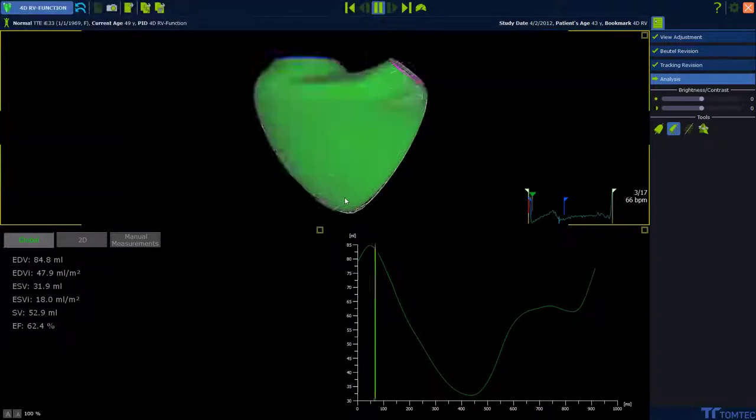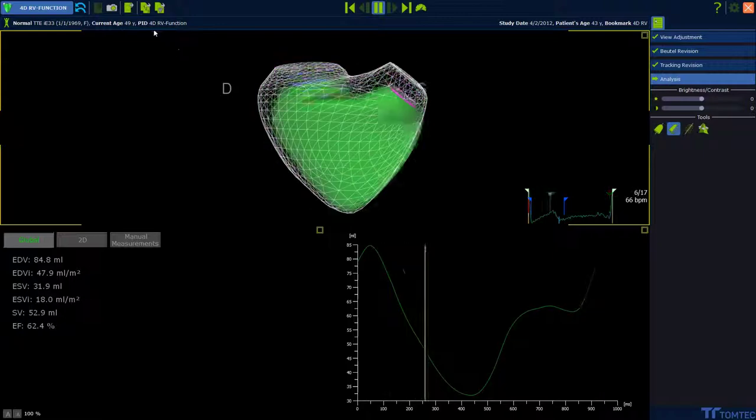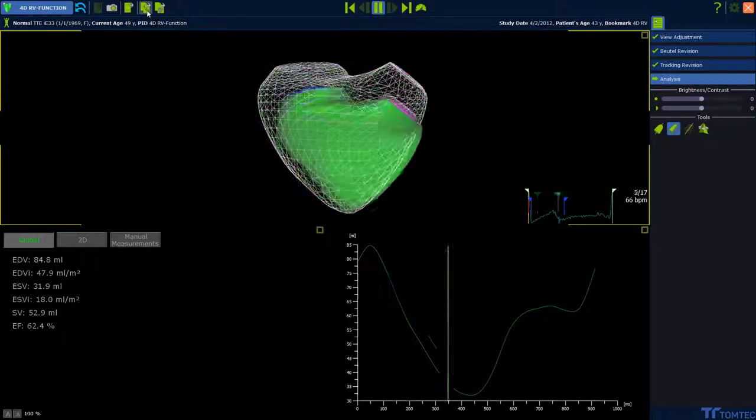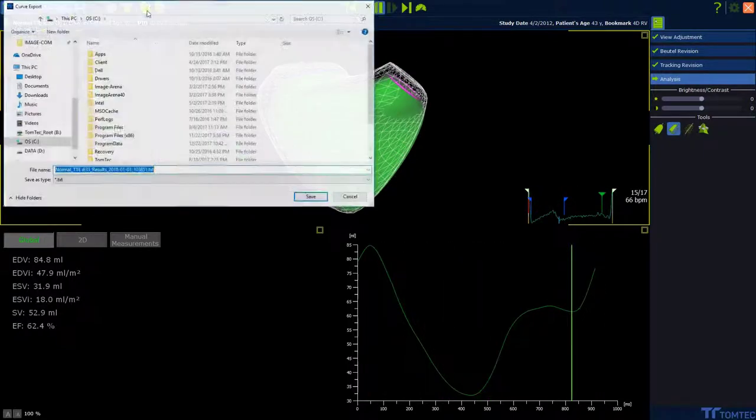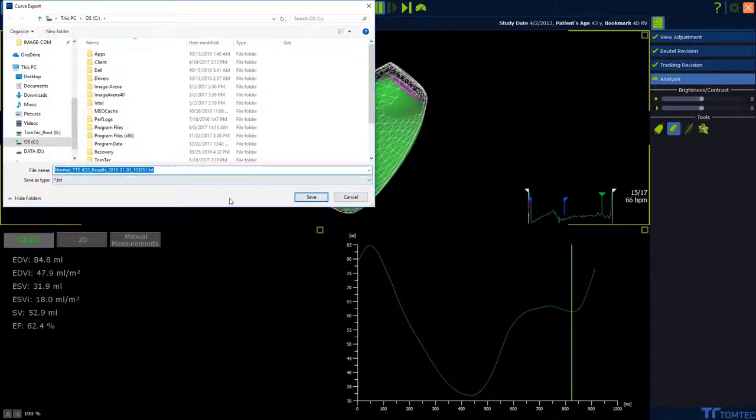The next icon means we can export our results. It's a text file.